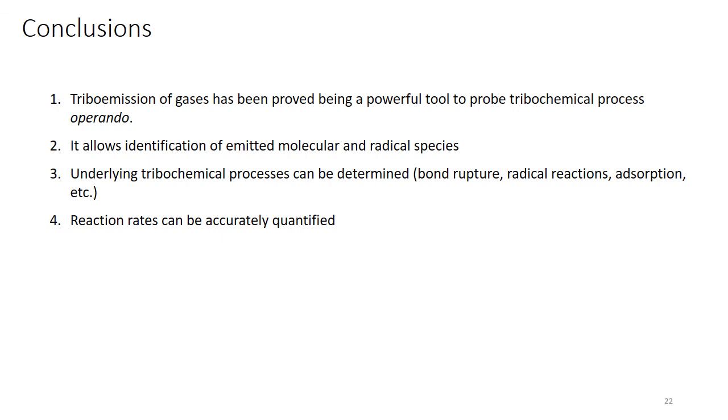Also, we can determine the underlying tribochemical processes by analyzing the time series and time constants of retarded emission. So we can identify which molecules proceed from bond rupture, from radical reaction, adsorption, etc. And finally, the reaction rates can be accurately quantified, so we can obtain quantified information.